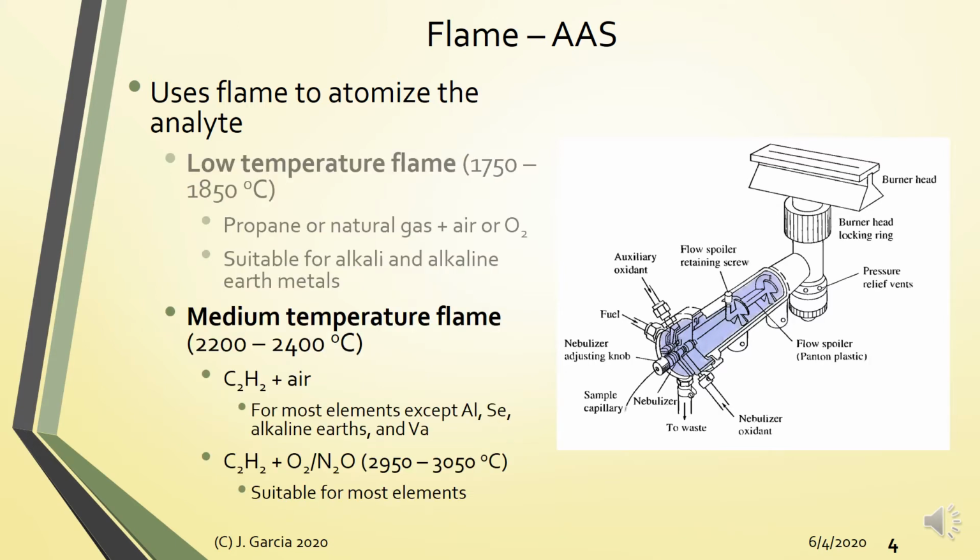The more common is your medium temperature flame. This is what we have in the laboratory at the chem lab at Adams University. What we're using there is a combination of acetylene gas as fuel and air from compressed air. And the temperature is roughly between 2200 to 2400 degrees centigrade.